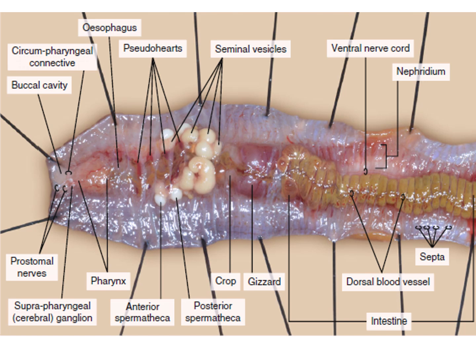The earthworms are largely herbivorous annelids. They obtain food by eating soil in their way and extracting nutrients from the soil as it passes through their digestive canal, and they take a mixture of soil and organic matter through the mouth. So we have to first identify the mouth of the earthworm.